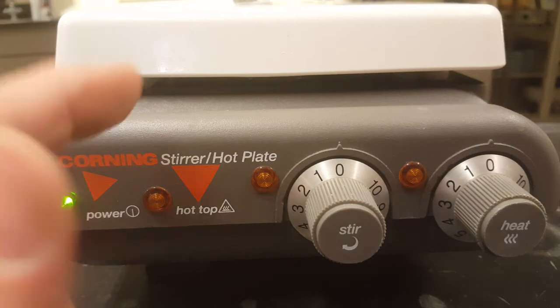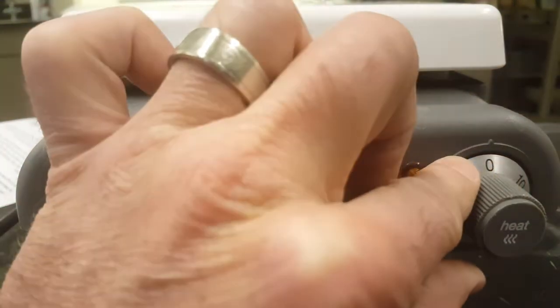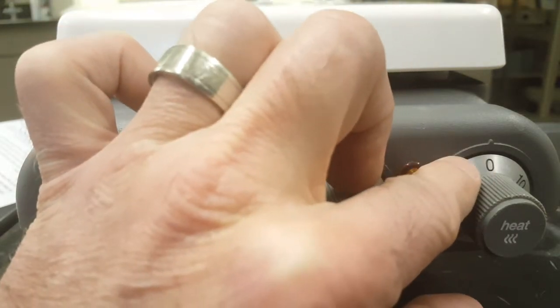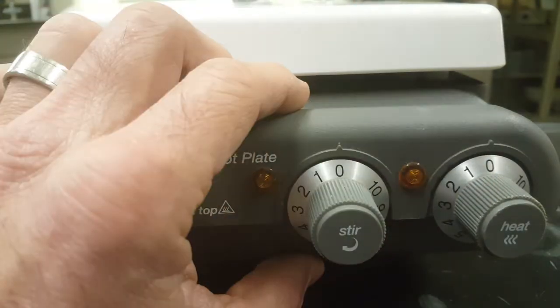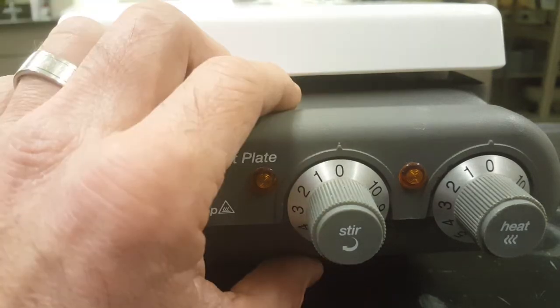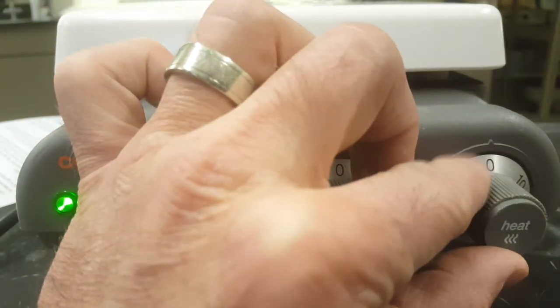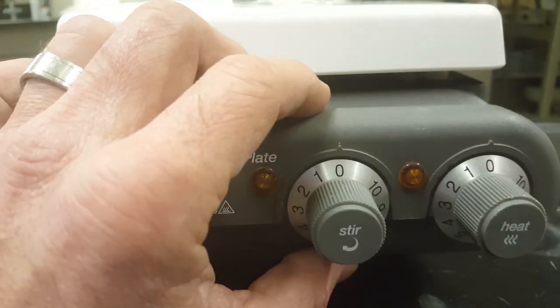If you're using a stirrer and a hot plate, make sure your heat is always to 0. If you turn your heat up, you're going to boil your acid, and then your acid will be aerosolized. It will be a gas in the room, and that's super toxic and dangerous. So we'll be walking around making sure that your heat setting is always set to 0.